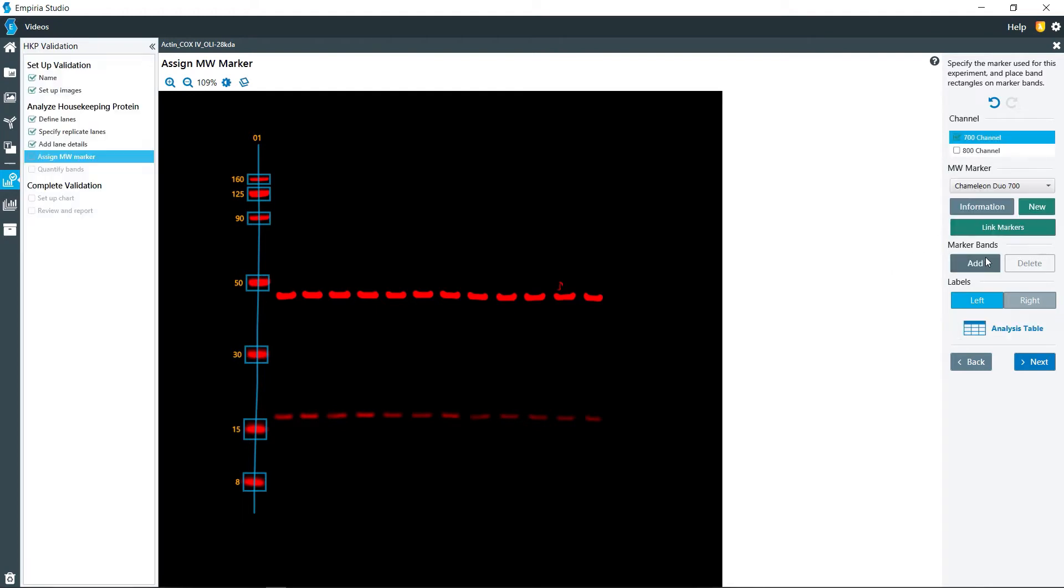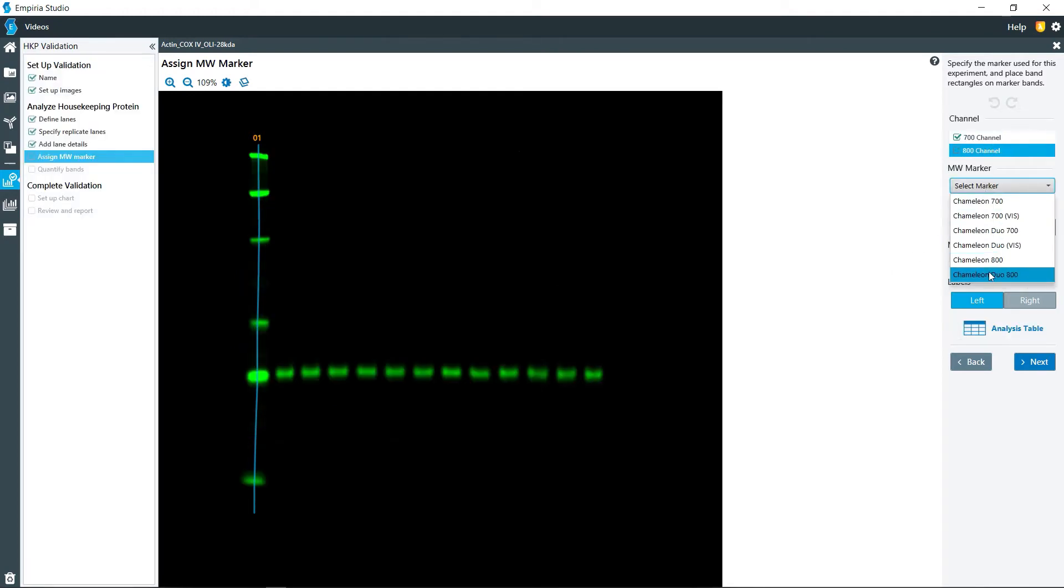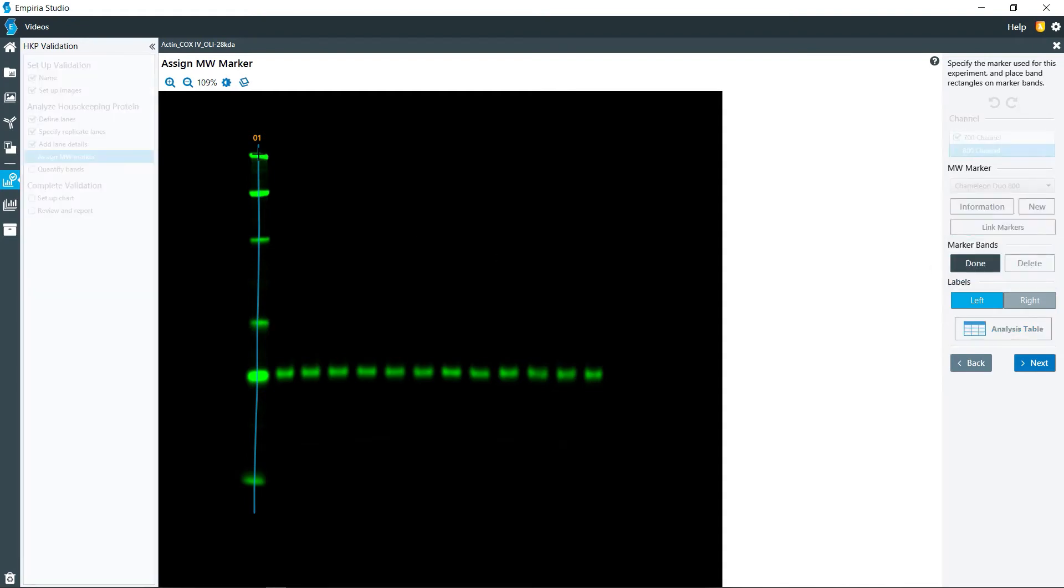I'm going to click done, and then in the 800 channel I will do the same operation with the Chameleon 800, click add.